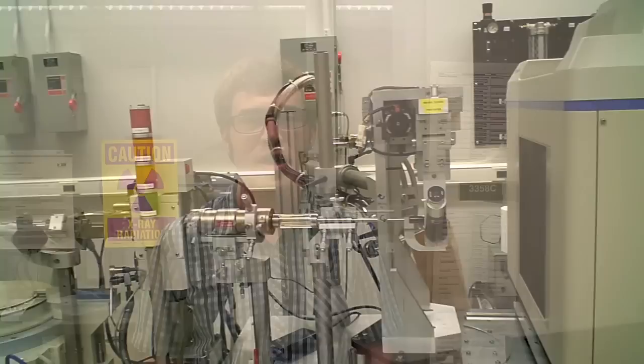We have a room that's held at 20 degrees and a room that's held at 4 degrees. So we can test temperatures as variables in our crystallization experiments.